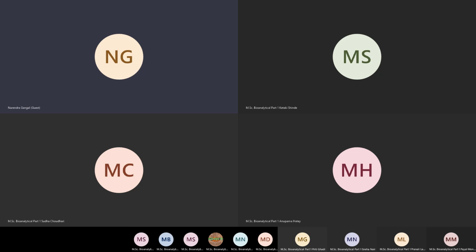So there I am going to use an alternate technique, which is an add-on to electron ionization, that is the chemical ionization technique. In chemical ionization, you need the EI data anyway, and in CI you introduce a reagent gas.